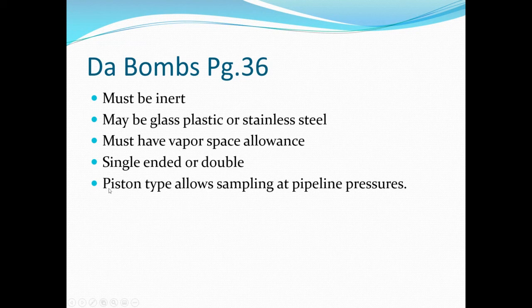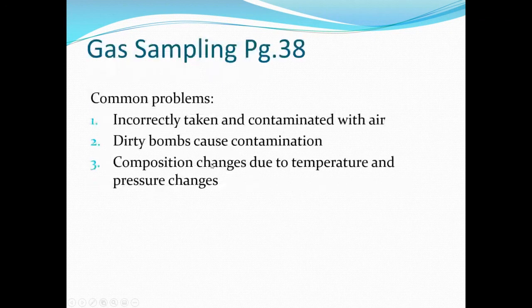Specific mention here of a piston type sample bomb, which allows sampling at pipeline pressures. This leads me to believe that I probably haven't spoken individually about this particular one. But I have had students come through the classroom who have worked on pipelines that have used these piston type sampling bombs in the field. And pipelines are one of a few unique applications where it might not be feasible to have a continuous online analyzer all the time due to the remote nature of pipelines and the fact that you might not have power out there. So the operators would have to go and do grab samples.